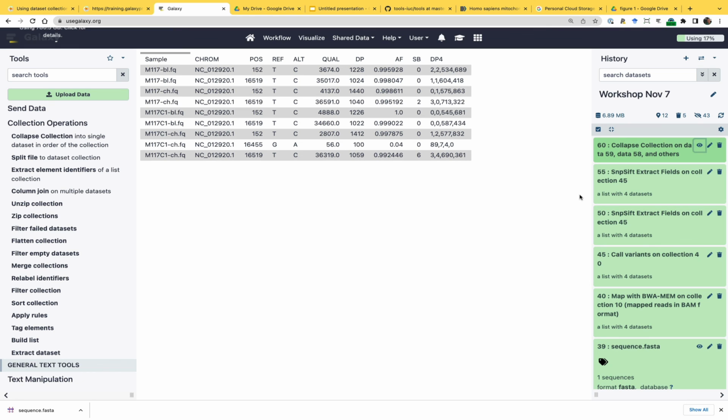But these are the strand-specific counts. So I have 89 references in plus, 7 references in minus, 4 alternatives on plus, and 0 alternative on minus. So it's a corner case. I don't know, but it's not a good call because I have the strand bias here.